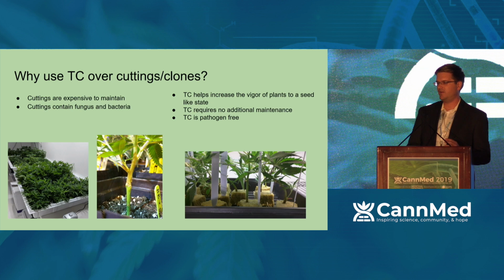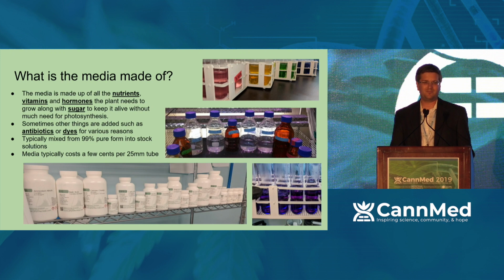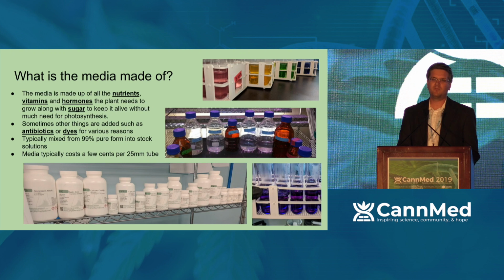One of the questions I commonly get asked doing consulting is, what's this media made out of? Really, it's just all the nutrients, vitamins, and hormones the plant needs in order to grow. Sometimes you can incorporate antibiotics to prevent pathogens from establishing or coming out into the media, or you can add dyes to color code some of your stuff. It's all about growing with an input of sugar. Instead of letting the plant photosynthesize, the plant grows off the sugar located in the media, along with all the nutrients, vitamins, and hormones it would normally need to grow.